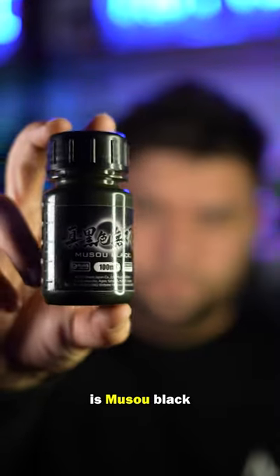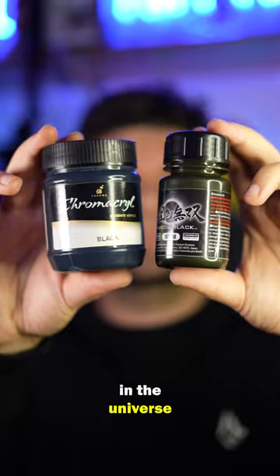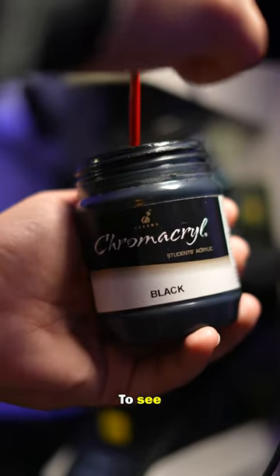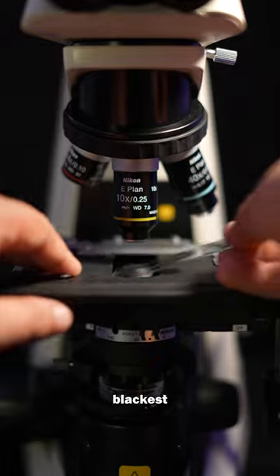This is Musou Black, one of the blackest paints in the universe, and we are going to look at it under the microscope to see why it is one of the world's blackest paints. But to contrast, I need to show you regular paint first under the microscope.